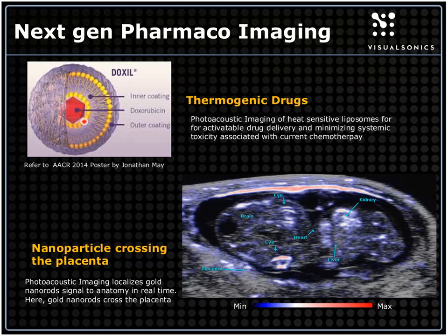drugs in standard care. The bottom image is actually an embryo sitting within its placenta. There's a placenta right up here.